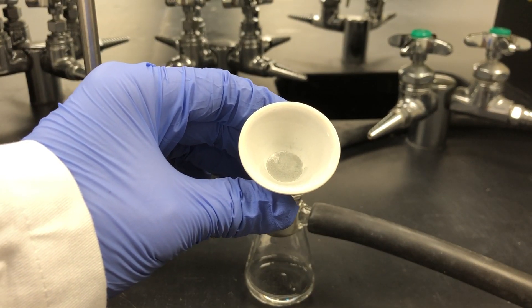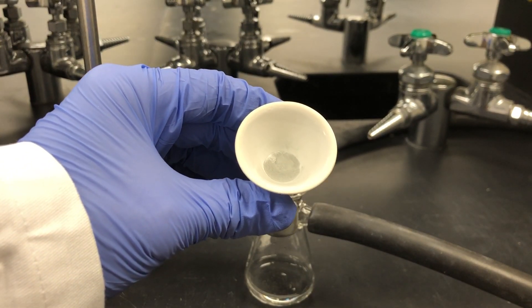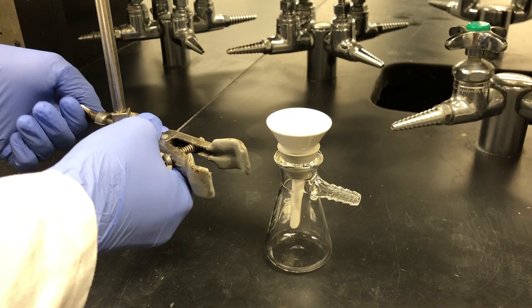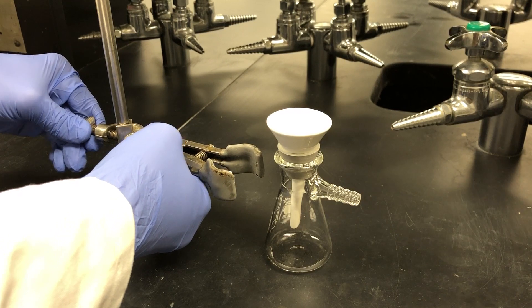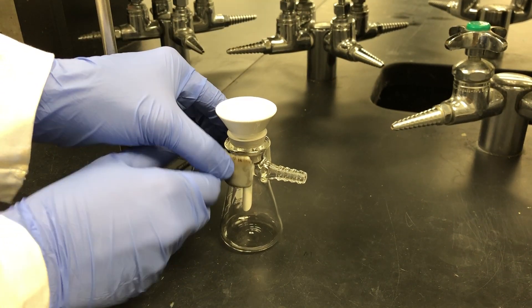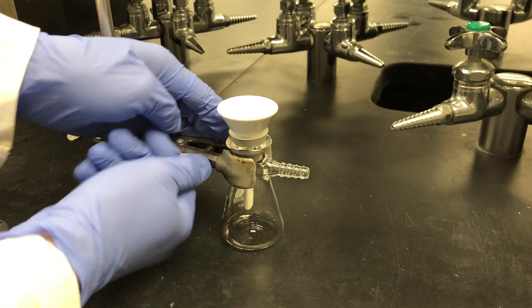To set up your vacuum filtration system, first place your Hirsch funnel and the rubber stopper securely into the top of the filter flask. Before you attach your vacuum tubing, you should secure your filter flask to the support stand on your bench using a two-prong clamp. This is to make sure your flask stays in place when filtering.